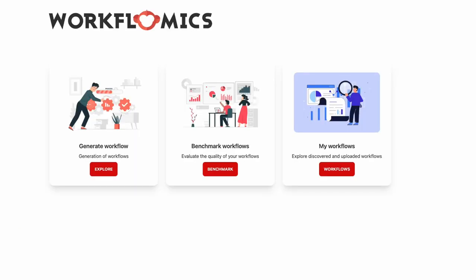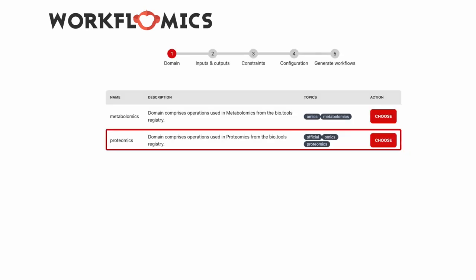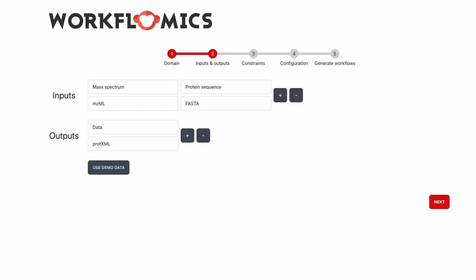Now I will give you an example of how Workflomix platform could be used. We will start by generating workflows to process our data and we choose the proteomics domain for our example.